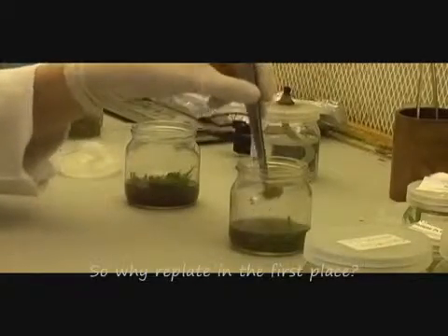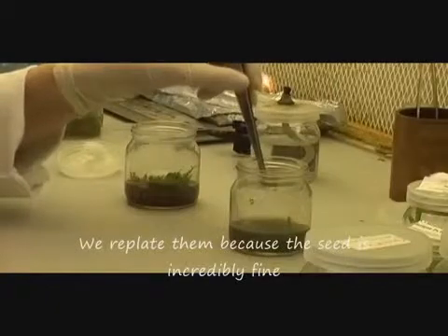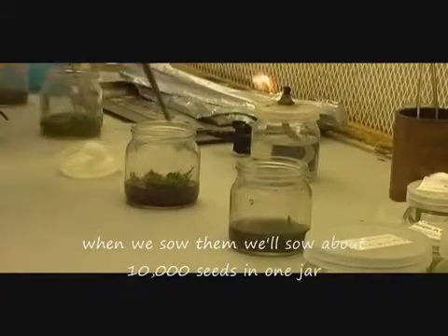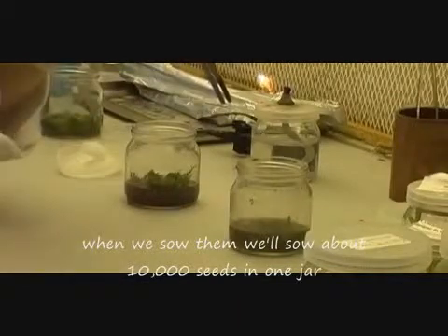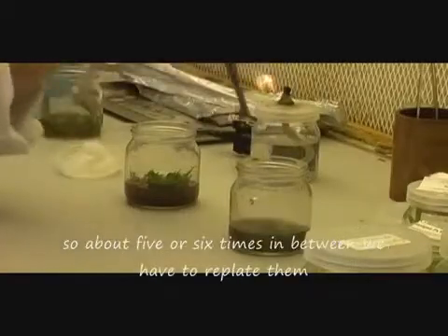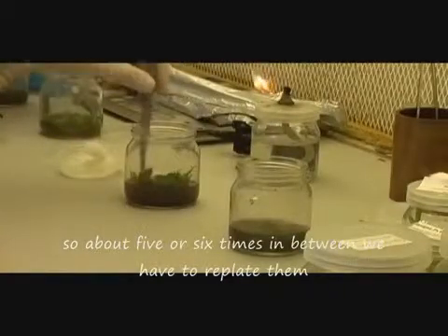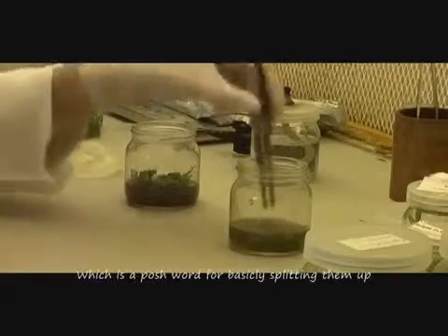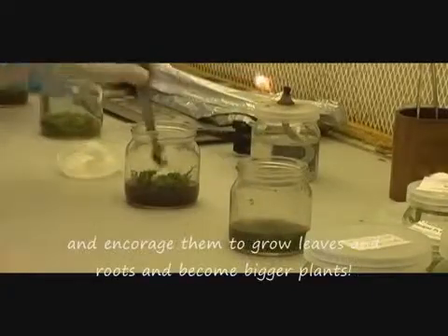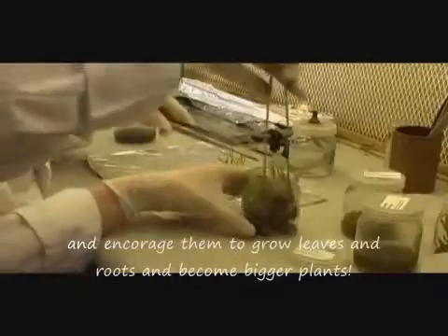So why do you have to replate the orchids? We replate them because the seed is incredibly fine and when we sow them we'll sow 10,000 or so seeds in one jar. When they get to the stage that they're two years old there'll only be about 10 orchids in each jar. So along the way about five or six times we have to replate them, which is basically splitting them up and encouraging them to grow roots and leaves and therefore become bigger plants.